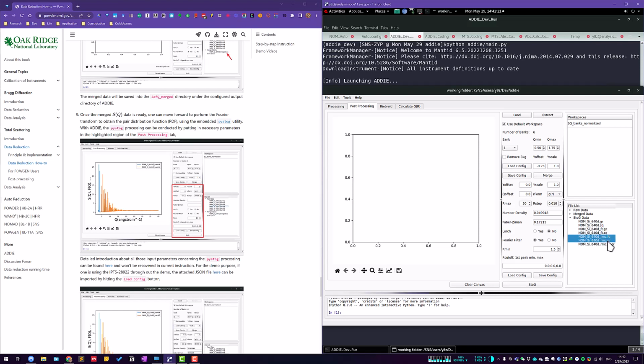And then underscore RMC is that after the Fourier transform, after the Fourier filter, we then transform the data into the reverse Monte Carlo ready data. By saying that, basically that's the data ready for RMCProfile analysis. So that's what we have here.